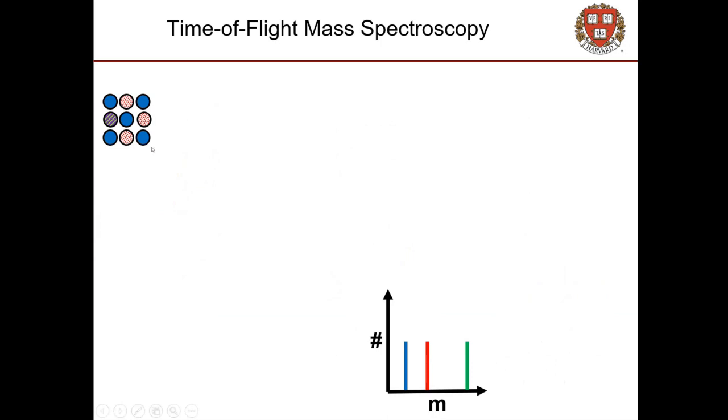Again, we are going to start with our chunk of material, and we are going to end, if we are fortunate, with a spectrum consisting of the number of chunks of material, of ionic and elemental species detected with each discrete mass. To get from here to there, the first thing we're going to do is apply some sort of burst of energy to our material.